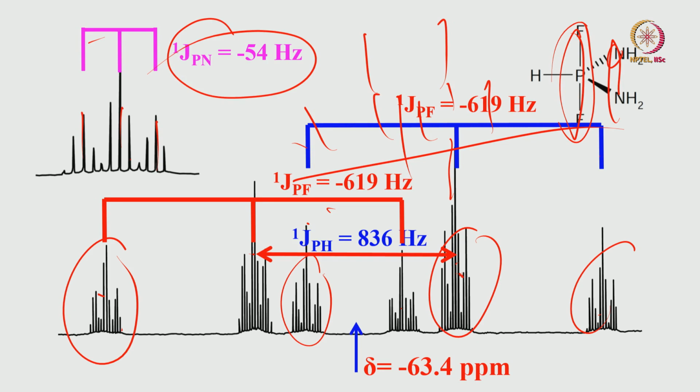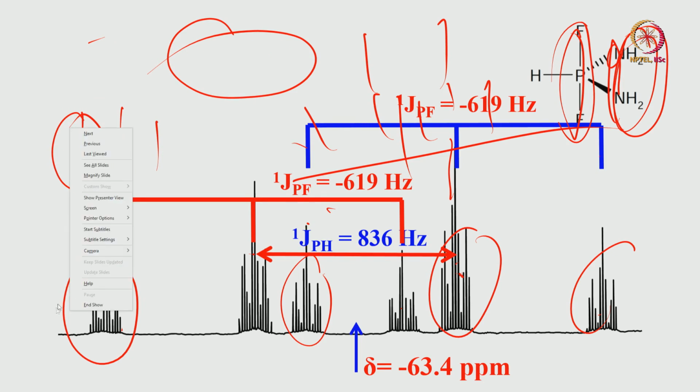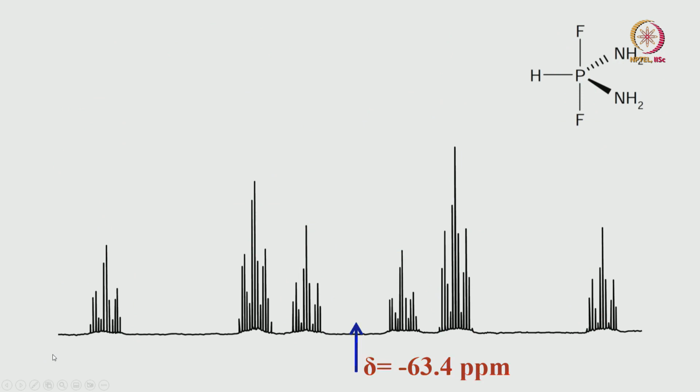Interestingly, this also coupled to 2 H2s, 2 equivalent protons. There are 4 protons, 2 equivalent protons, 2 each. Then each of them is split into a quintet pattern like this. See, 2 pH coupling is like this is one quintet, another quintet. There are 3 such things. Very interesting.